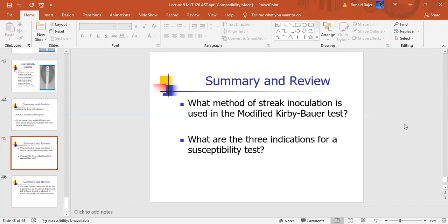You know why? Because there is no BSC level 4. That's a trick question. I'll throw out trick questions like I did in hematology. Make sure you know your different types of laboratory, your BSL level laboratories and your BSC safety cabinets.